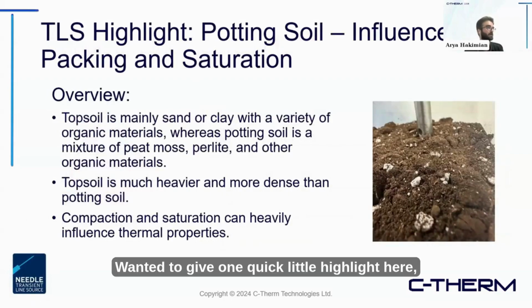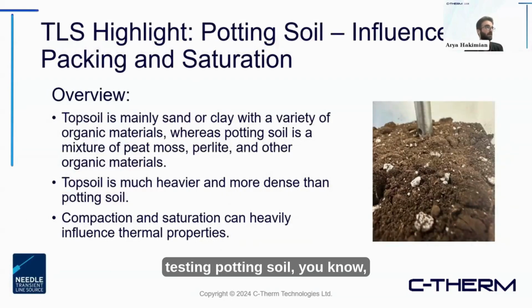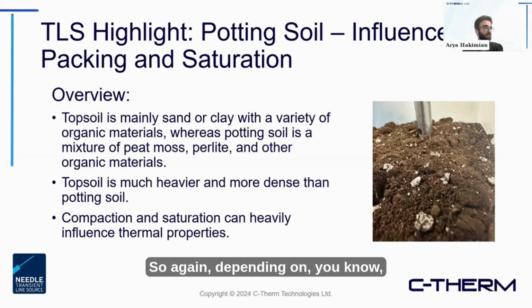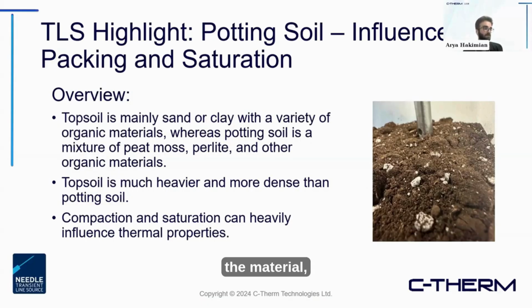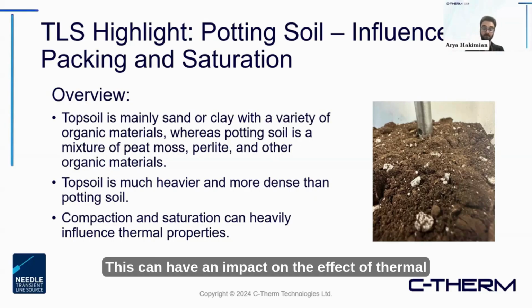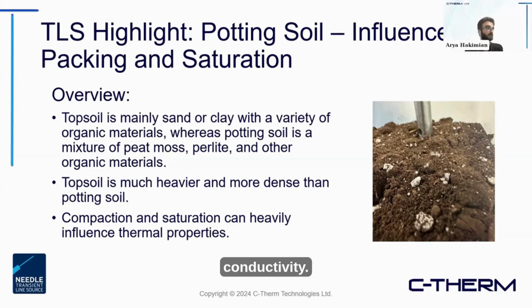Wanted to give one quick little highlight here, testing potting soil, looking at the influence of the packing and the saturation. So again, depending on the material, those considerations like how dense the sample is, is it dry, is it partially saturated? This can have an impact on the effective thermal conductivity.